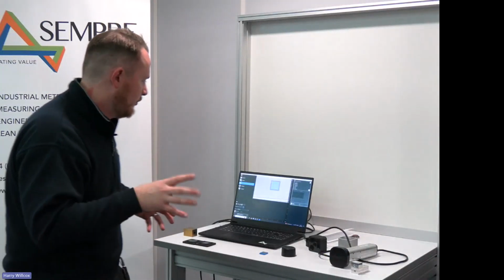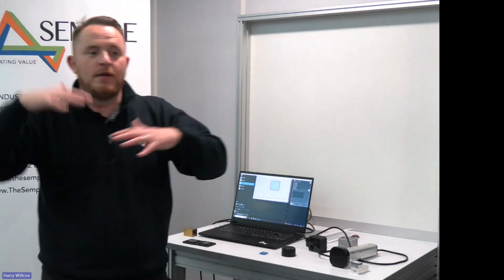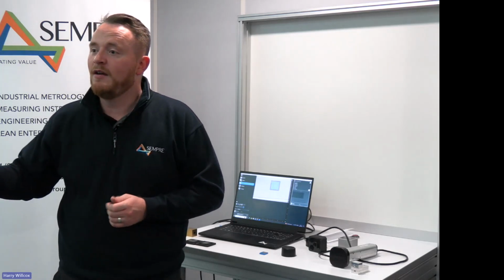The reason that we can't do it within the Gelsight software is we don't know where we are to normalize. So it's probably something that I should go and speak to them about, because if we have a reference position, in theory we should or could stitch the data together. So I'll ask the question to Gelsight and see what comes back. If you can make a note of that, I will get back in touch with you when I've got some information as to if they're looking at it or when it potentially could be done.